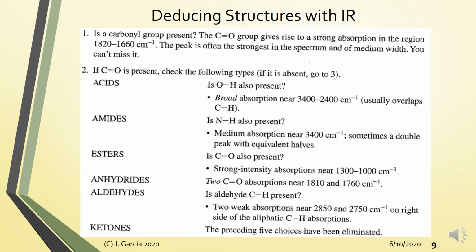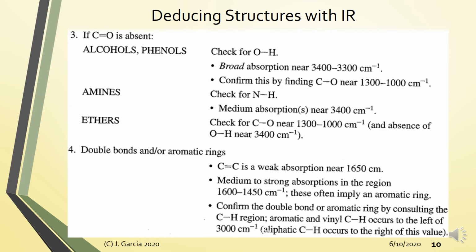If wala lahat yung mga features na ito and may carbonyl ka, then basically you have a ketone. Alright, so napakadali lang nung technique. Alright, deductive lang. Now, what if wala kang carbonyl? So kung wala kang carbonyl, then all of these are impossible, no, choices doon sa iyong problem. Alright, so kung wala kang carbonyl, then may mga choices, no? So it can be yung walang carbonyl na functional groups.